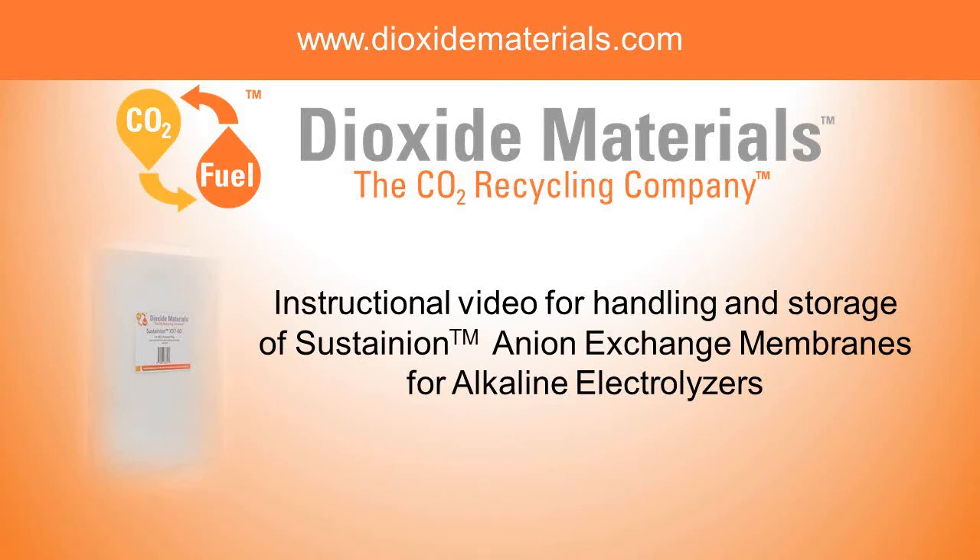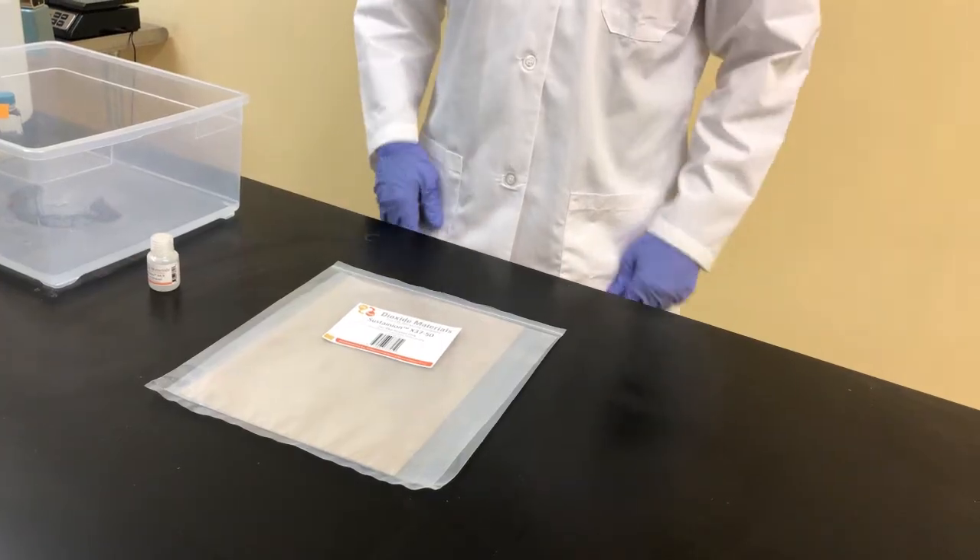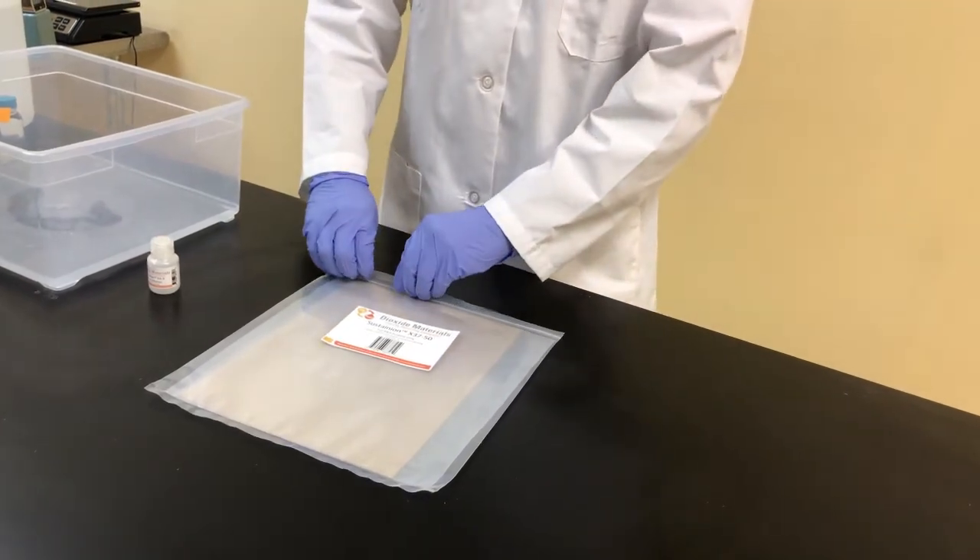Thank you for ordering your Sustainion Anion Exchange Membranes for Alkaline Electrolyzers from Dioxide Materials, the CO2 Recycling Company. As we get started, please remember to wear your goggles, your gloves, and follow all SDS information that was provided in your package.